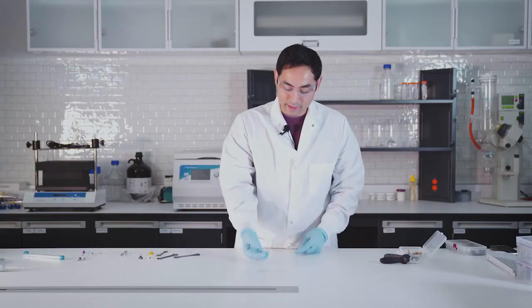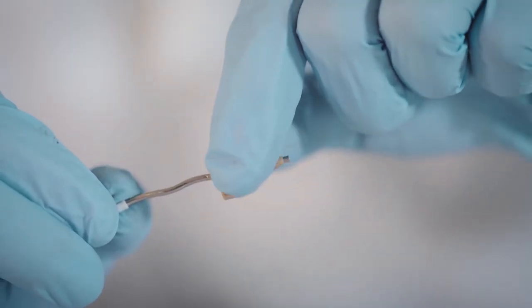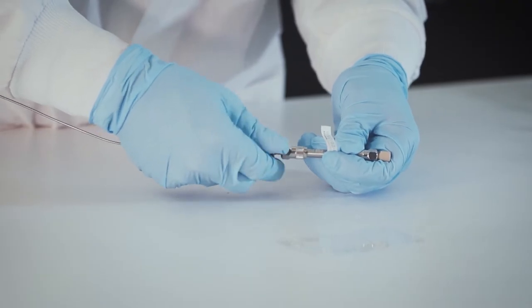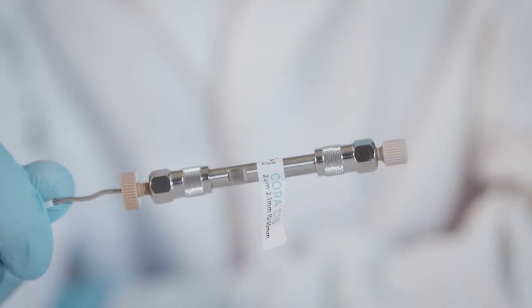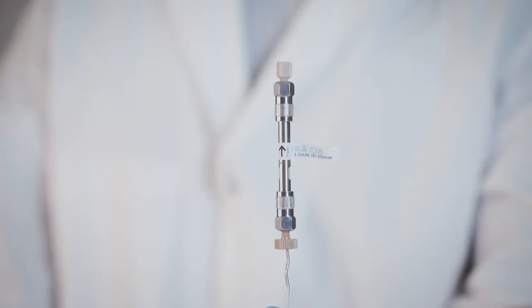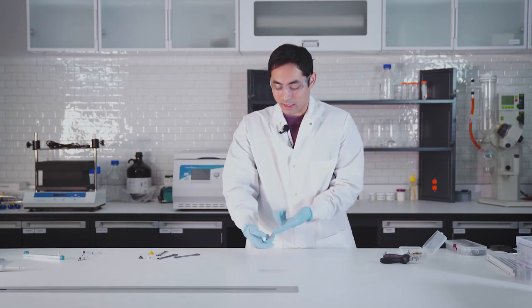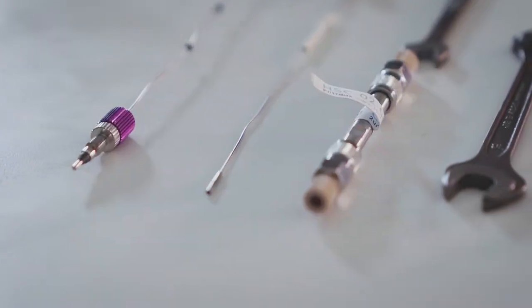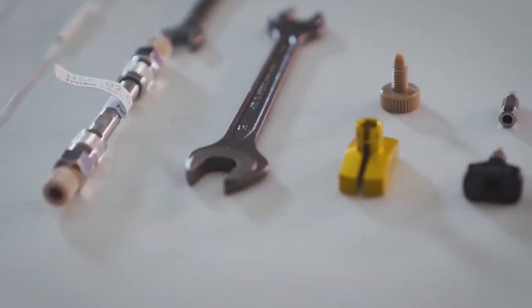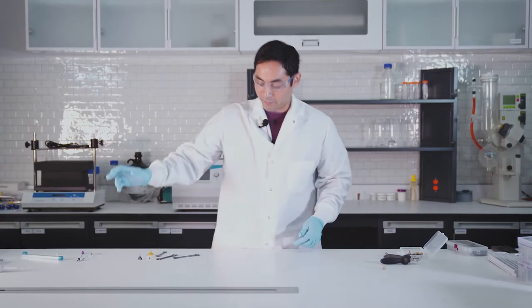Now let's talk about improvements. Obviously a finger tight fitting is nicer. You put it over tubing and it only needs to be finger tight. The drawback of using this type of finger tight fitting though, it's only pressure stable up to around three thousand or three thousand five hundred psi. So if you get any high pressure it's gonna leak. That's why the stainless steel fittings are more used because they could withstand higher pressure.